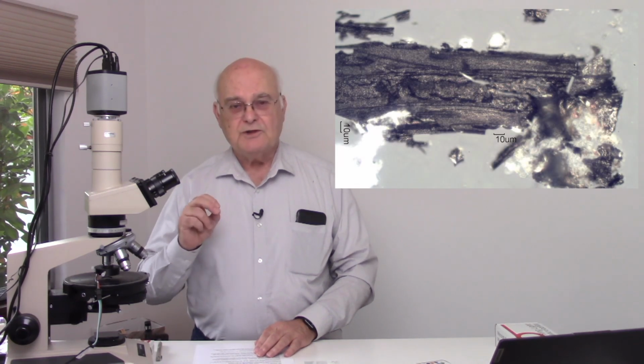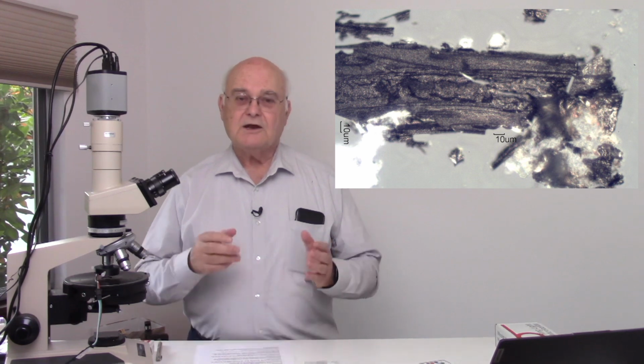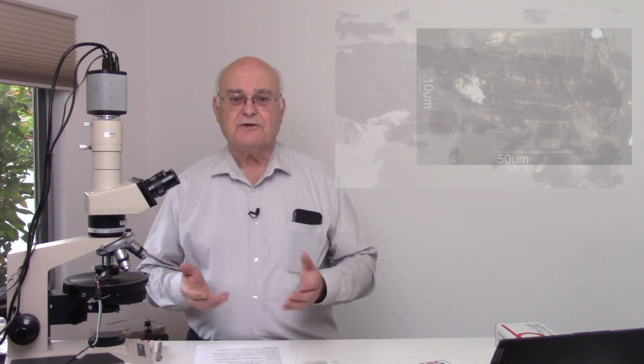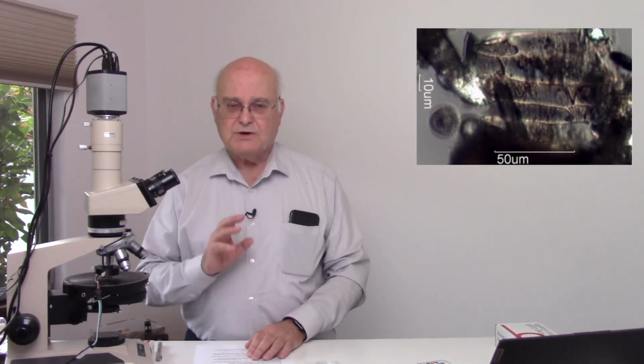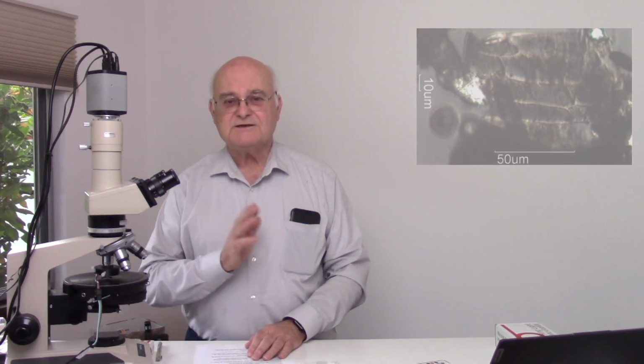For our purposes, it can distinguish easily between the charred plant material and black plant material that may be black just as a result of composting. It's important to be able to identify the char as distinct from other black material.